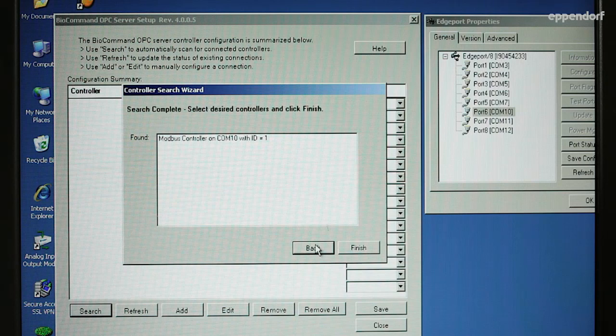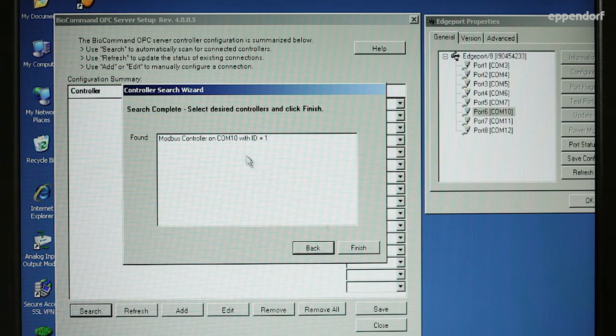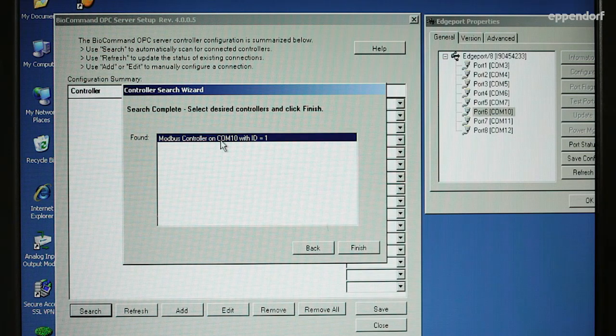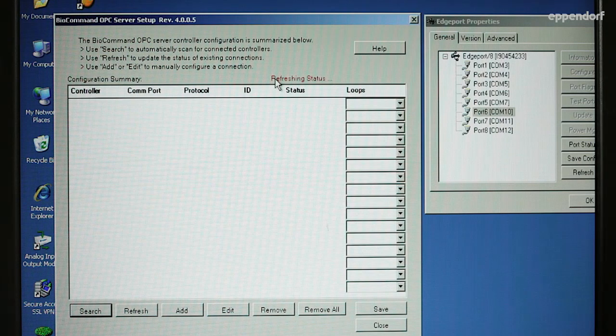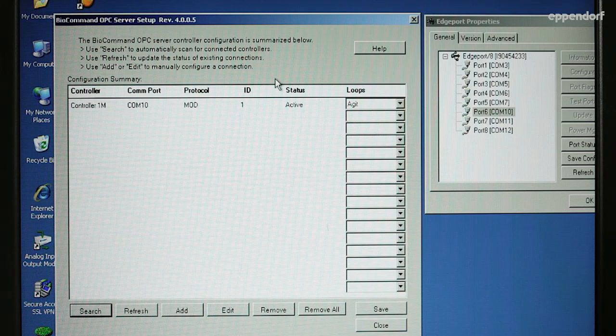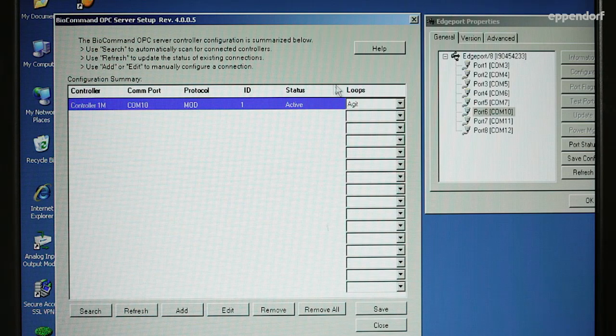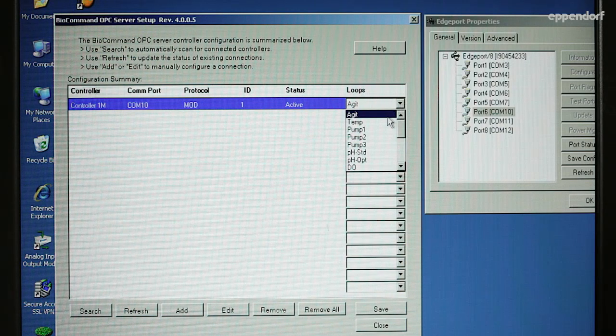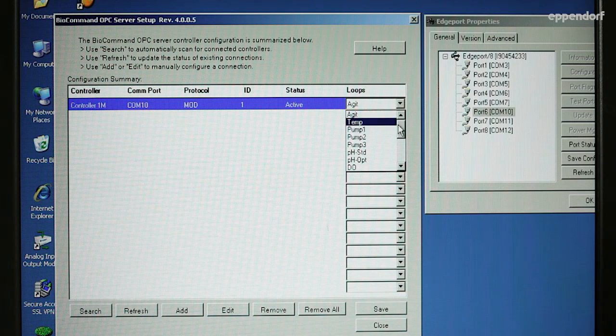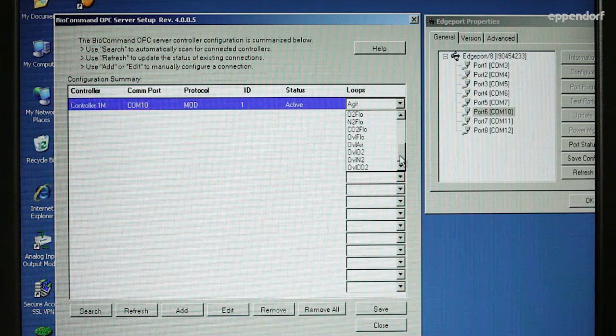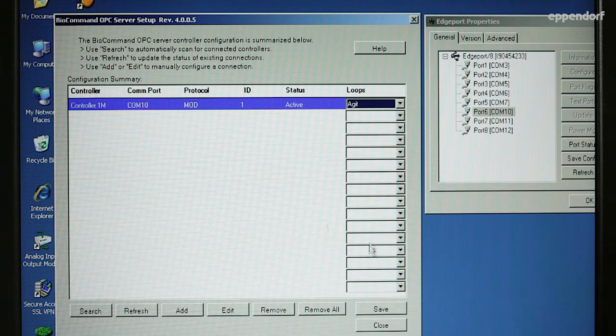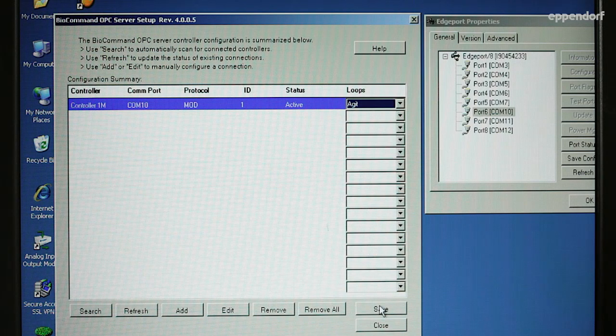Select the controller you wish to connect to from the search list and click the Finish button. The main window is now displaying the selected controller with an active status. Click Save and Close to exit from the main window.